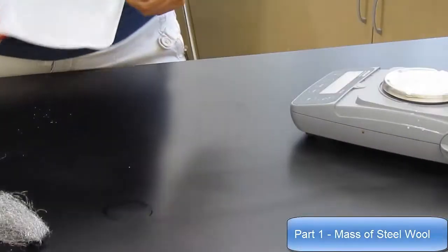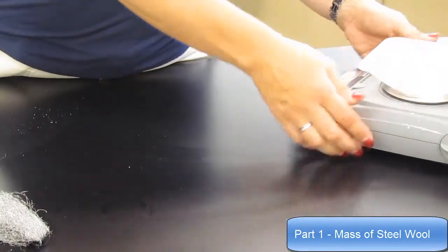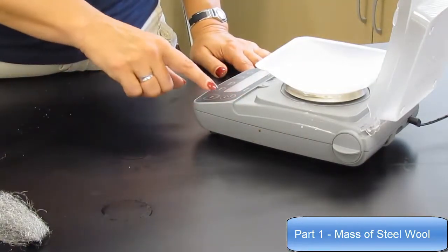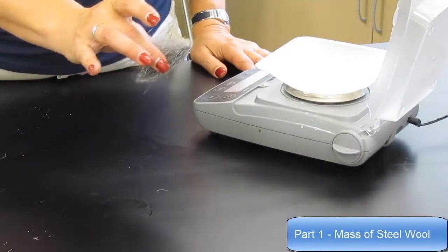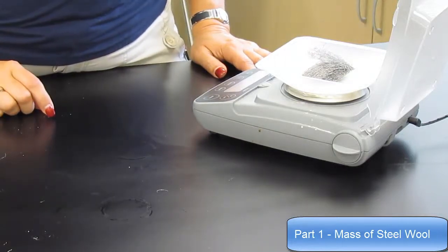Part 1, mass of steel wool. For this one, you're going to need a weighing dish. Zero the weighing dish or tare it. There's a button on the balance that can do that. Then take some steel wool, place it into the weighing dish, record your mass.